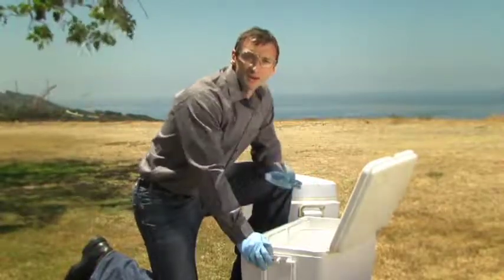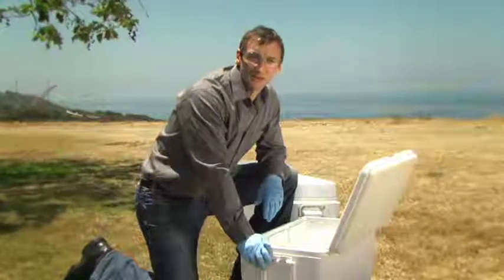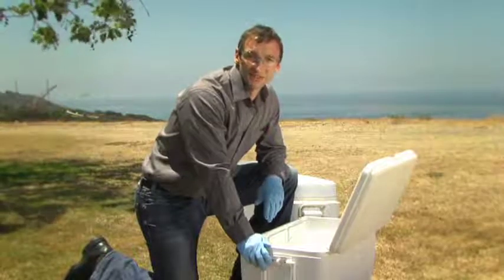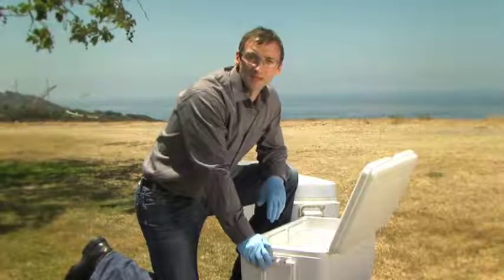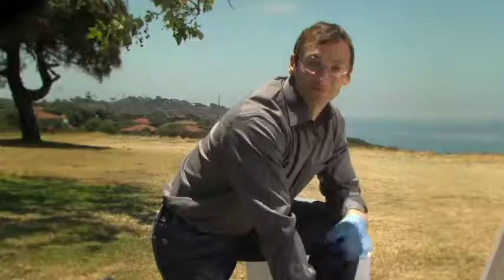Now, all these samples are listed on this chain of custody form. Since these are routine compliance samples, we're following a typical custodial rather than more stringent legal chain of custody procedures. Before placing the original chain of custody form in the cooler, we make a photocopy for our records.